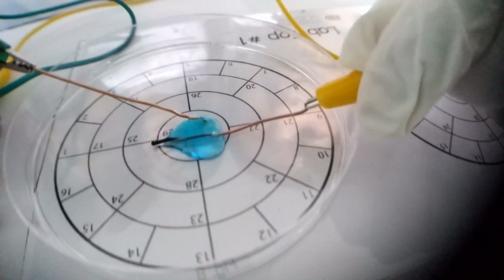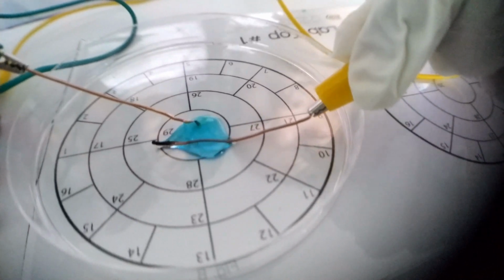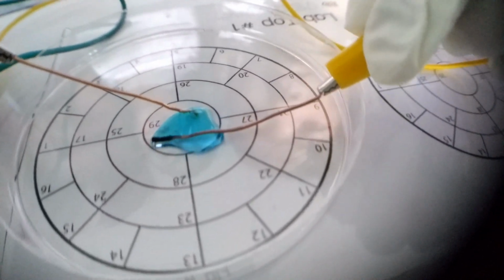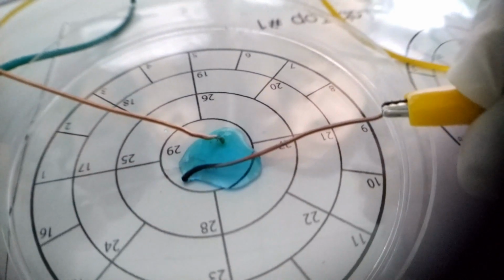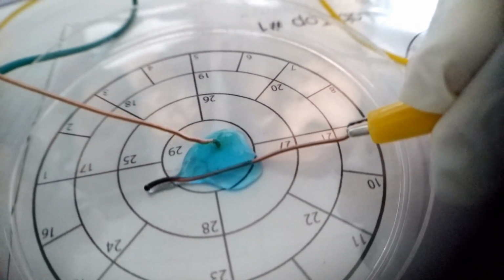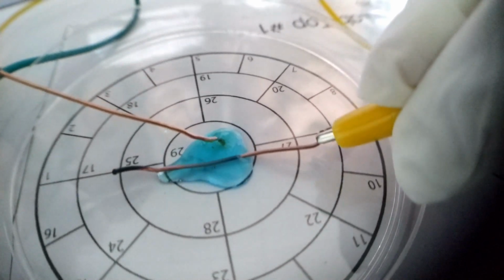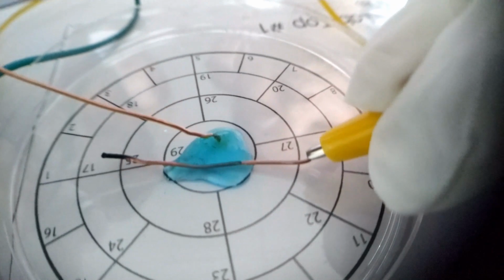During the electrolysis, reduction occurs at the cathode. So, which one will be reduced, Cu2+ ions or H+ ions? The answer is Cu2+ ions, because the reduction potential of Cu2+ ions is higher than that of H+ ions. On the other hand, oxidation occurs at the anode.